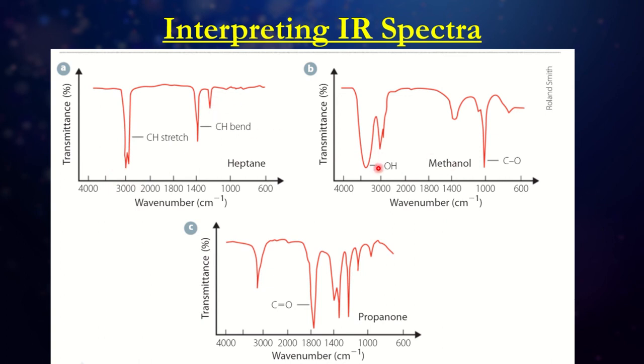We can also look at it based on the functional groups. Oxygen and hydrogen is a smaller atom combination than carbon and oxygen, so you see that one there. And then we can also differentiate in terms of double bonds as well. So there's that.